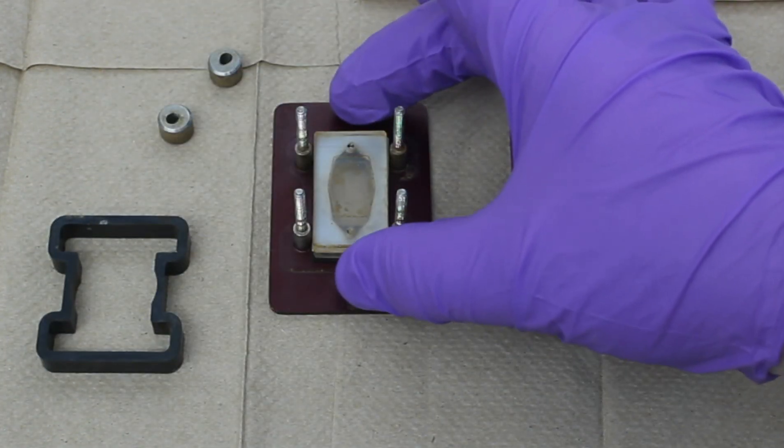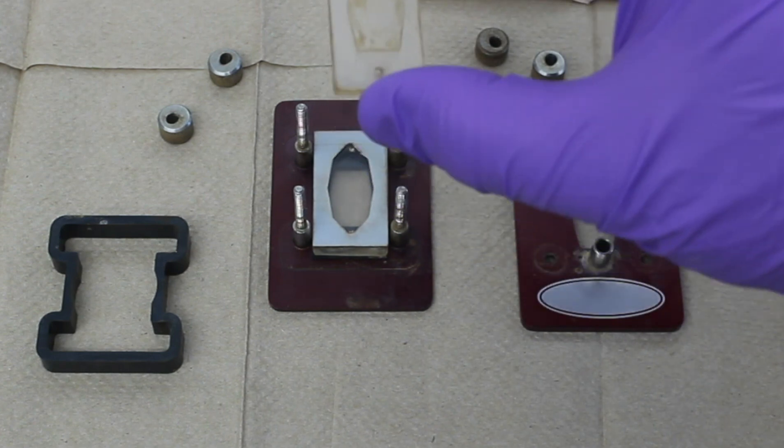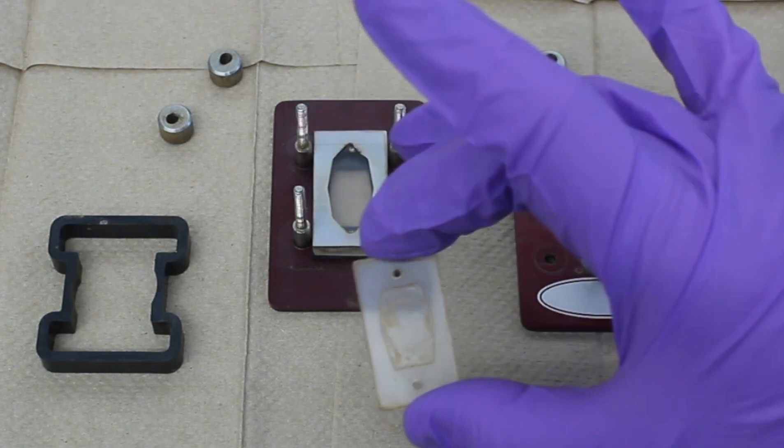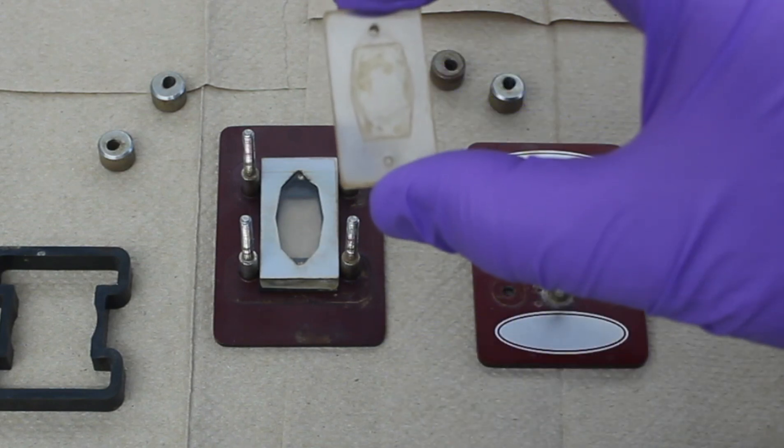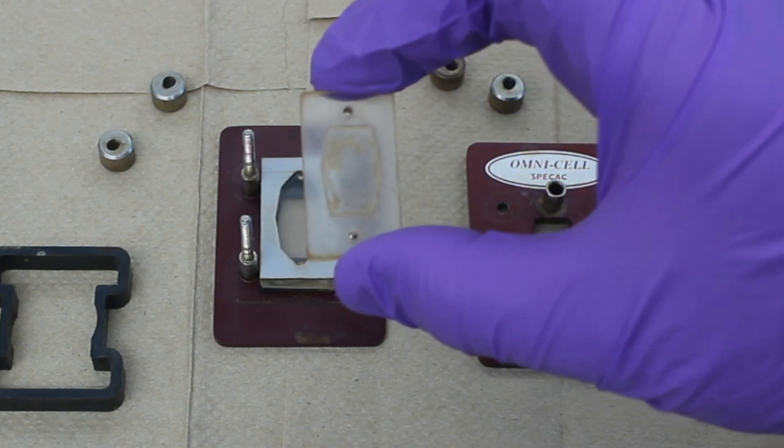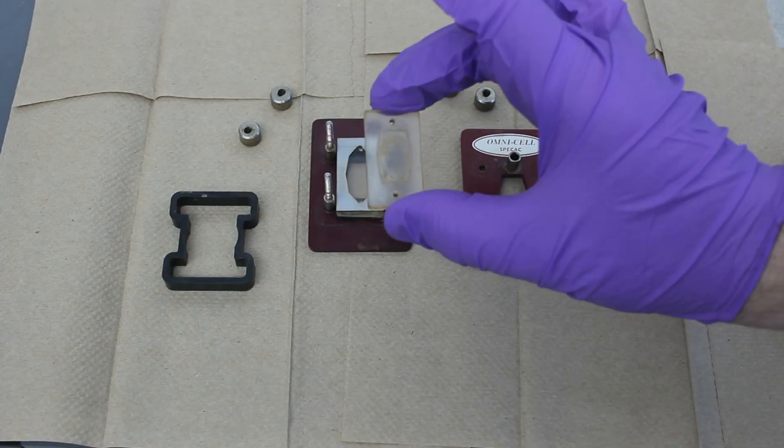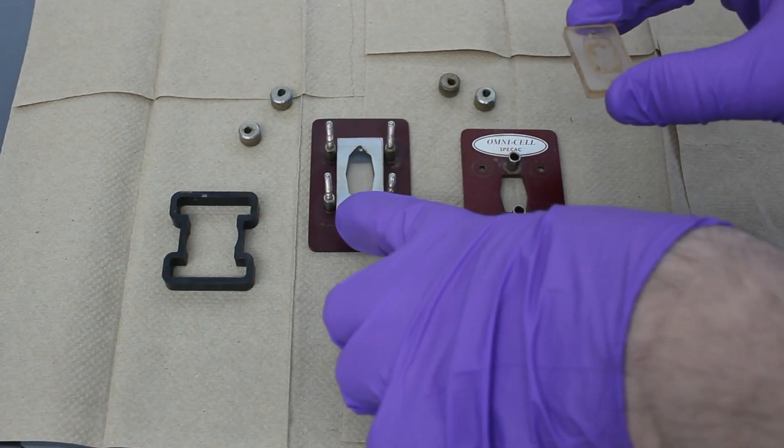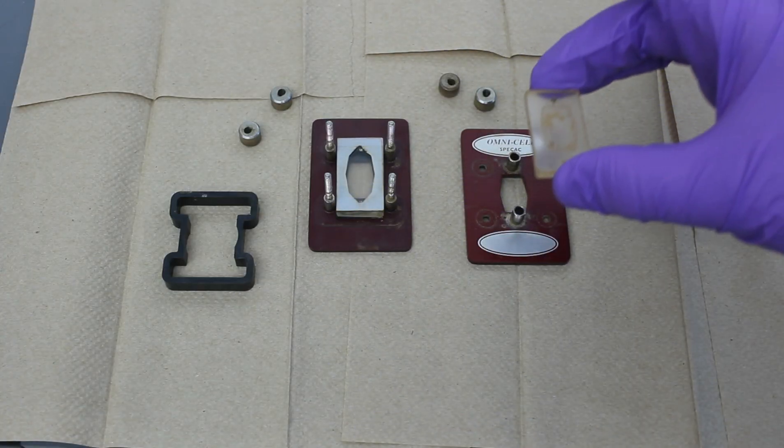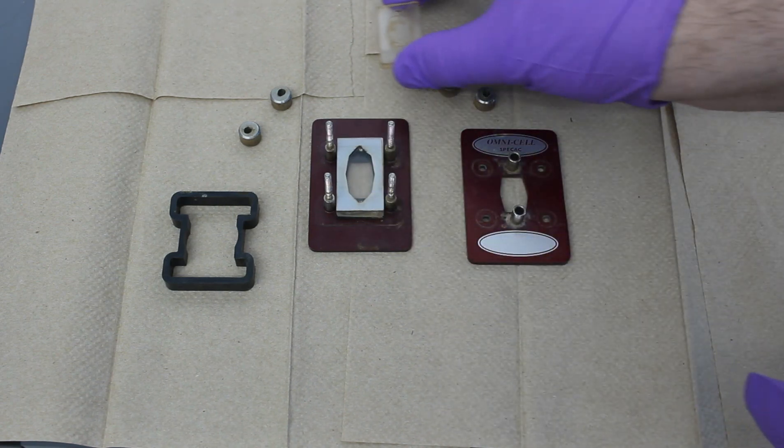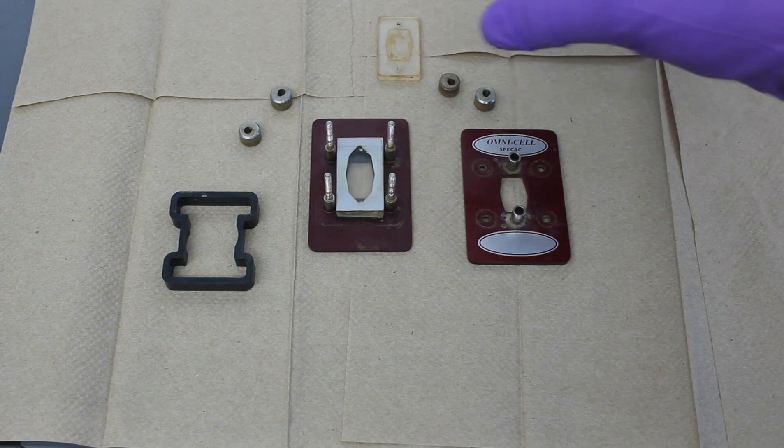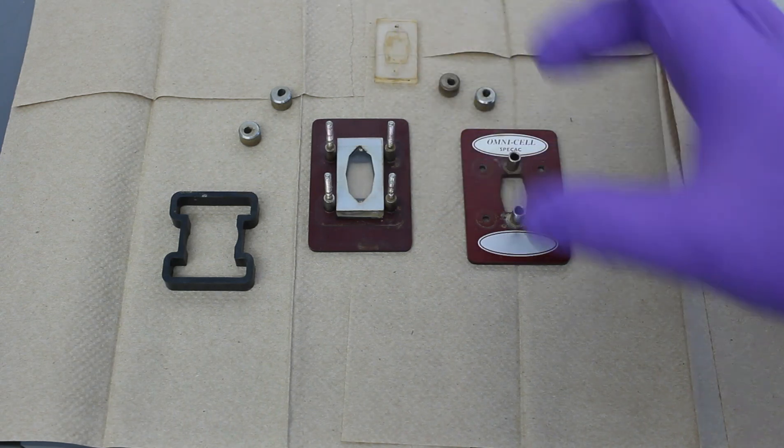And now you have to be very careful. So this is a sodium chloride plate. It has holes on top and on bottom so the liquid that you're trying to analyze can flow through the cell. This is a Teflon spacer that separates the top sodium chloride plate from the bottom one.